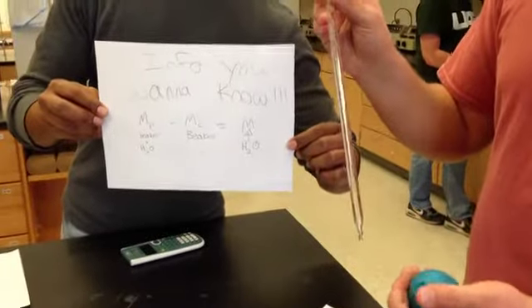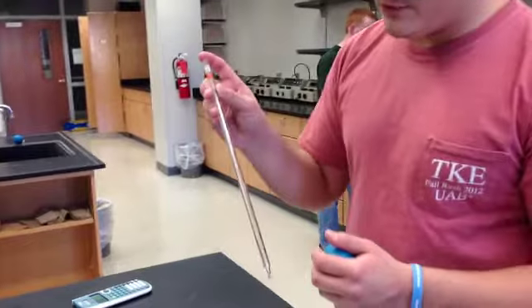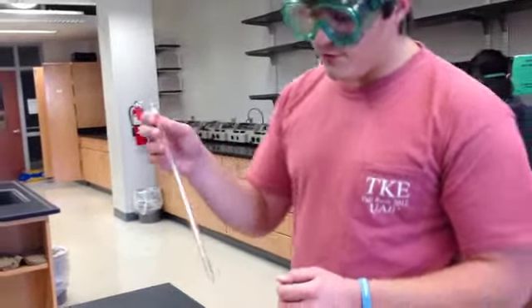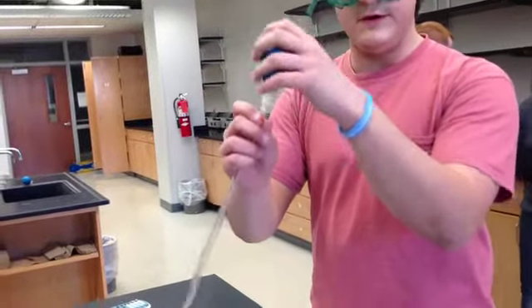Before using it, you want to make sure that it's properly cleaned. And the way you do that is you want to wash it with solution and water 3 times before use, okay? And so when you use it, the bulb doesn't actually stay on, it's going to be very loose, that's normal.